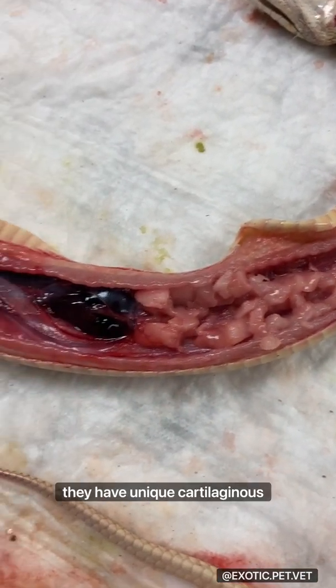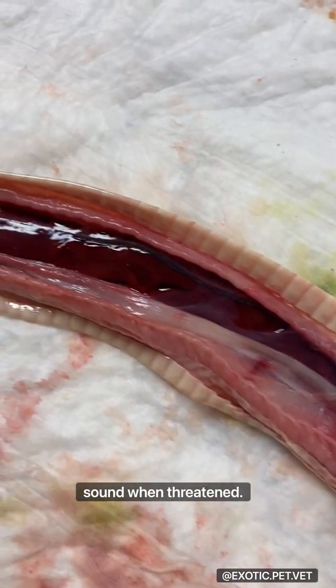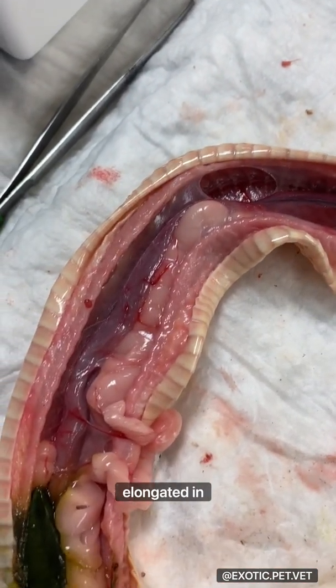Although I forgot to show it, they have a unique cartilaginous epiglottis that allows them to make a convincing rattling sound when threatened. Their organs are similar to other animals, however elongated in shape.